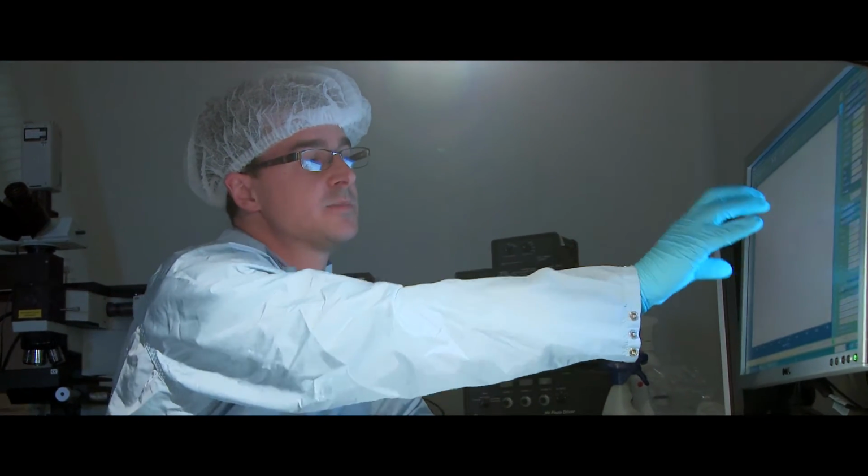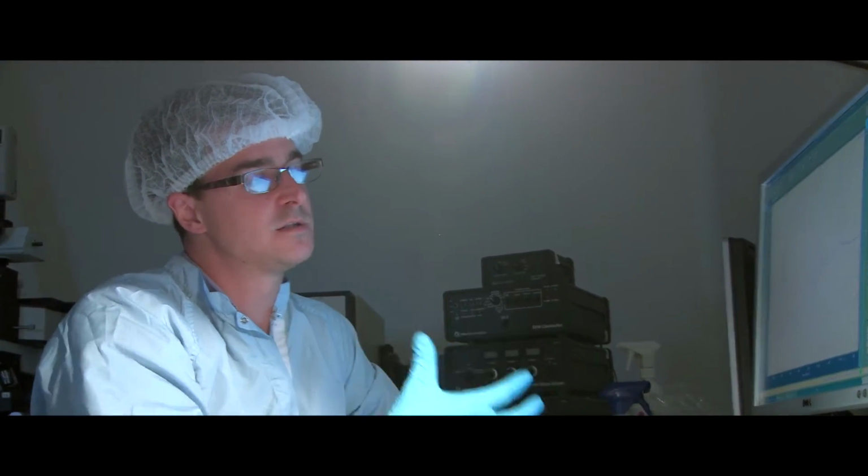So these are some of the compounds that those cells are using to help protect them from the ultraviolet radiation in the desert. So Raman is very good at giving you not only the minerals and the rock that you're looking at, but also the signatures of life itself clinging on to the underneath of those rocks.